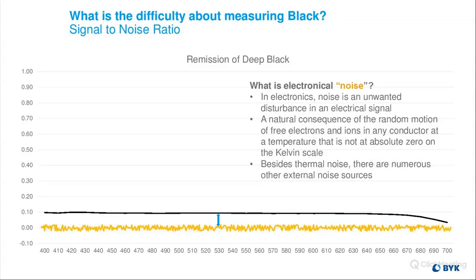All right, so once we figured that out, we came into another issue where the electrical noise inside the instrument is starting to affect the measurement. You can see in this graph here that this line is getting so low, so we were able to distinguish very accurately what this black color is. But at a certain point, we come into the problem where the electrical noise caused by an instrument is creating a problem, and it's giving us these varying results.